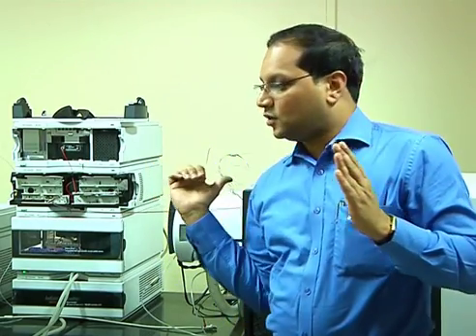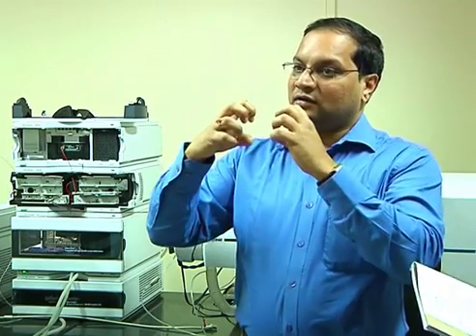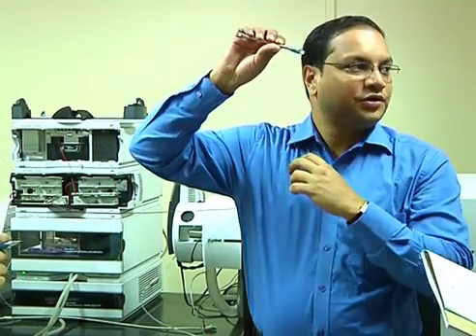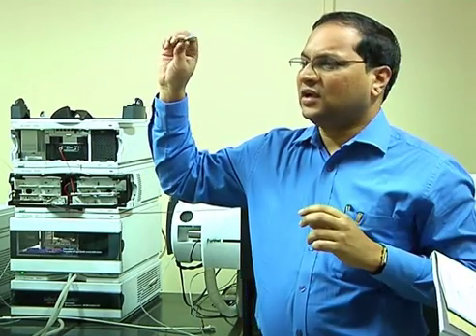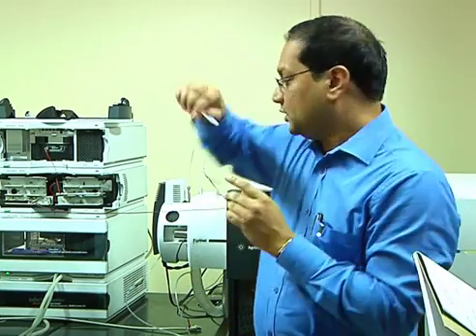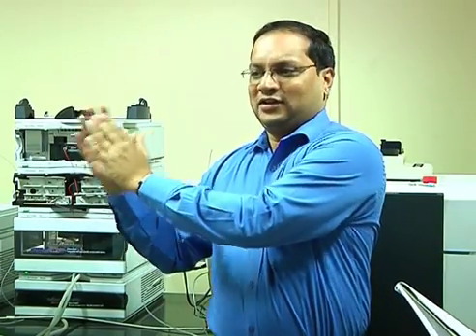To reduce that complexity, we use a separation technique before an MS so that your peptides get retained based on their hydrophobicity in the stationary phase, which we call the HPLC column. If anyone has not used an HPLC, it looks like this. It has some stationary phase, typically silica-based C18, depending upon what type of chromatography or chemistry you are running. So it gets retained based on hydrophobicity, and then you elute those peptides at different time intervals. So of 10,000 peptides, 2,000 will come at 1 minute, the next 500 will come at 2 minutes, like that. Then you split all those things, and then your TOF, or your MS, can see them with its full capacity, and you won't miss them. That is one: you reduce the complexity of it.